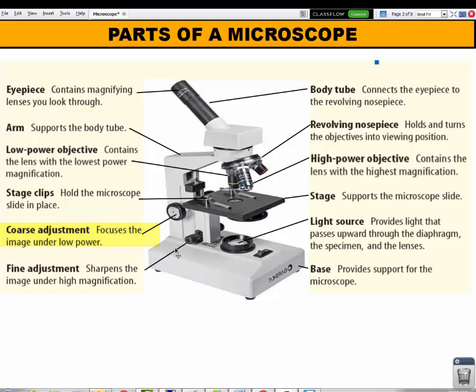Then we have a smaller adjustment knob called the fine adjustment, and this sharpens the image under high magnification. So the fine adjustment knob is only used on the blue lens. This way the blue lens doesn't drive through the slide and crack the slide that we're looking at.